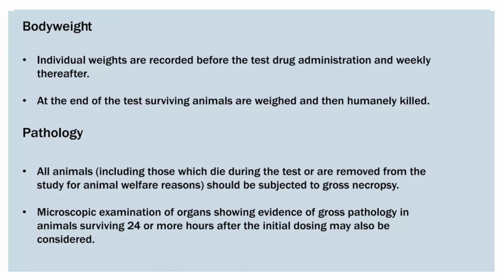Body weight. Individual weights are recorded before the test drug administration and weekly thereafter. At the end of the test, surviving animals are weighed and then humanely killed.